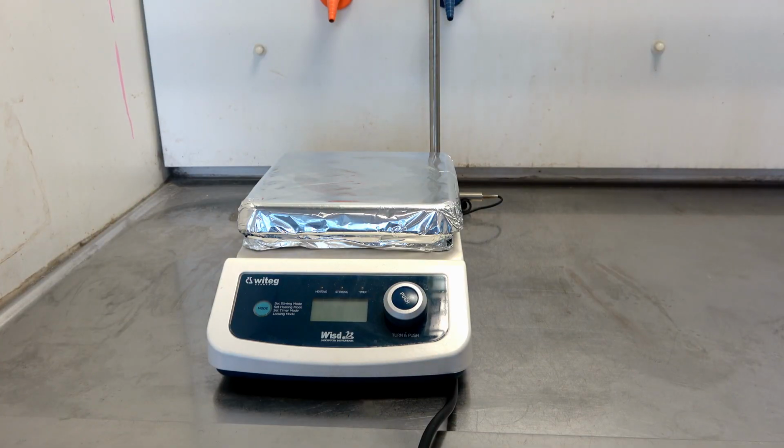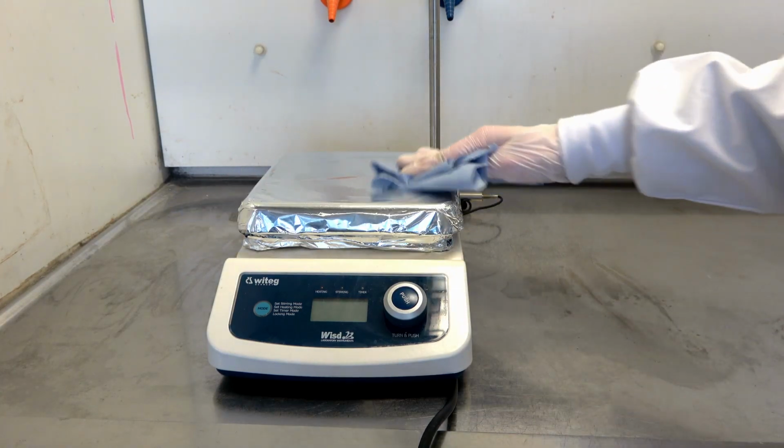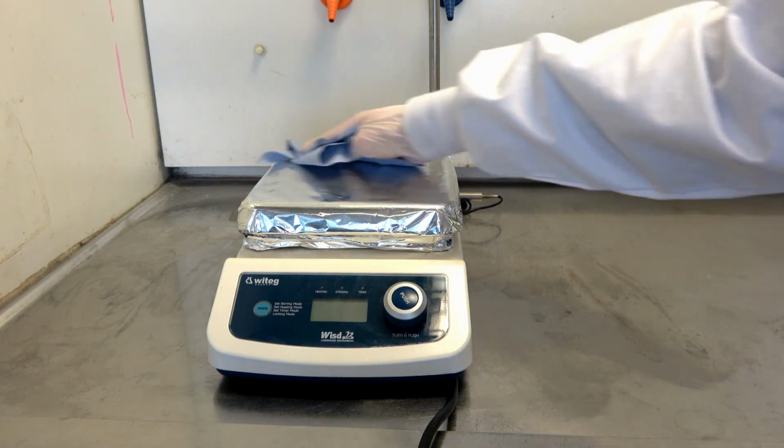Make sure to leave the instrument clean after each use. Wipe off any spills using tissue paper, and if necessary, change the aluminum foil on the hot plate.